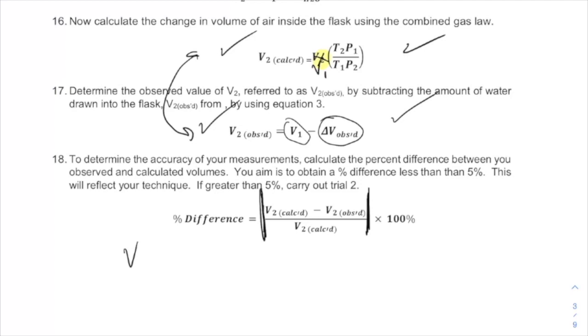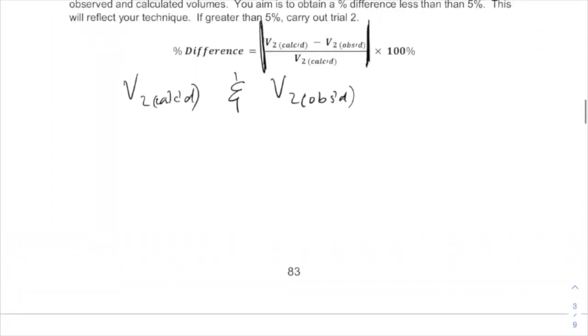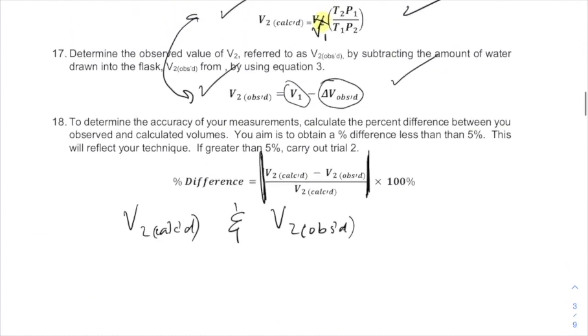So the whole purpose of today's experiment is to calculate V2 and to measure V2. And if I did a good job, these two values should be the same. Very low, very small percent difference. Okay, so please enjoy the video.